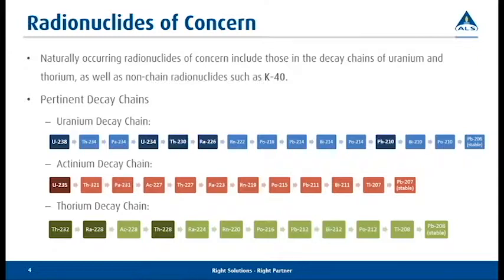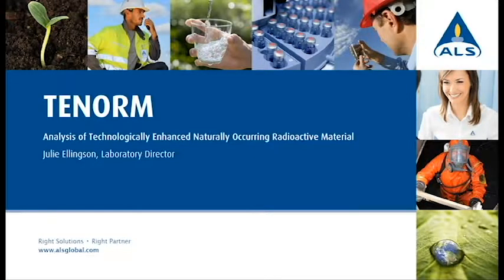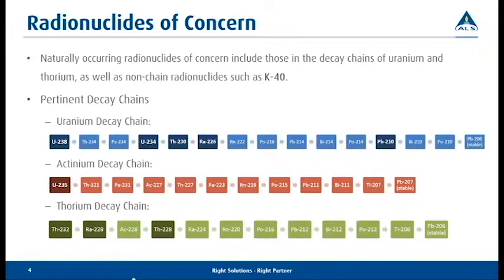He says, are there methods to detect other radionuclides, americium-241, curium-244, and neptunium-237? So yes, the americium, curium, and neptunium are all done by alpha spec methods. They can all fit within the ASTM method or kind of fall in with the HASL 300 for both of those. You will see both of them are very similar. In most cases, the americium, the neptunium, and the curium typically are considered fission products versus natural, so you're not really going to come across them in a natural setting. But we do test for them here, and they're going to be very similar to what we use for uranium and thorium methods.